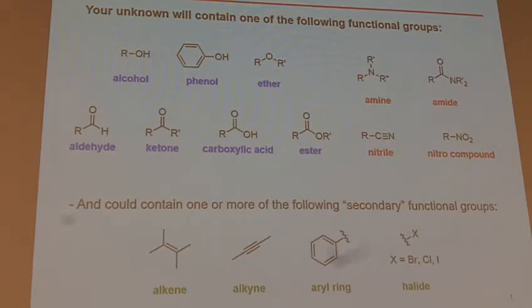No. But of the things I just mentioned, what would help you out to figure out which one you have? Mass spec. So what you'll need to review is if you believe you have a halide, make sure that you review what you look for in the mass spec to figure out which one is present, okay? And that was all coming from lecture information last time, all right?